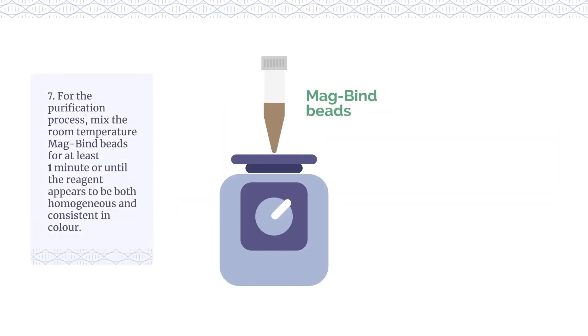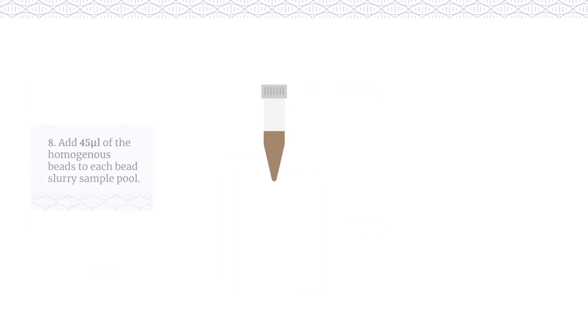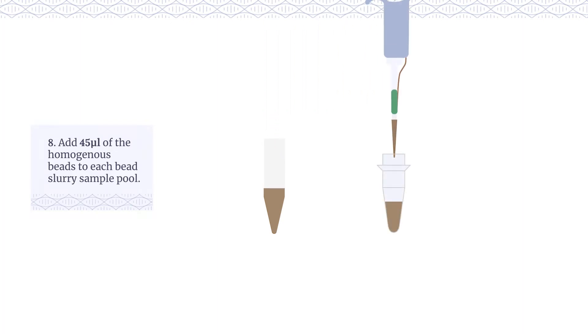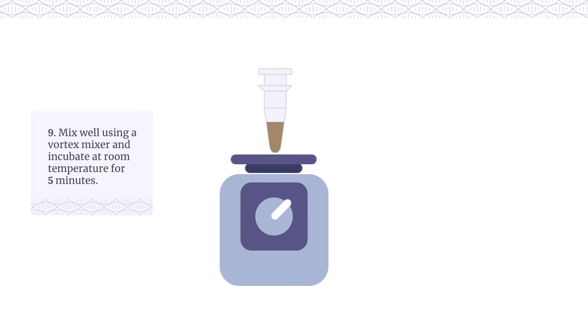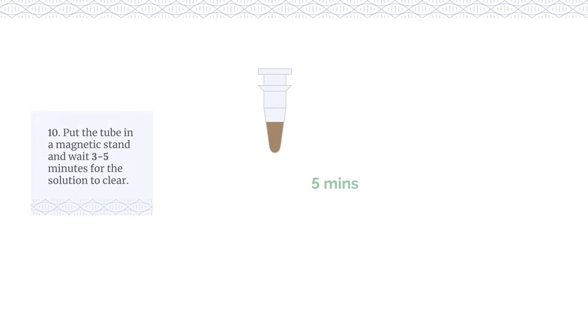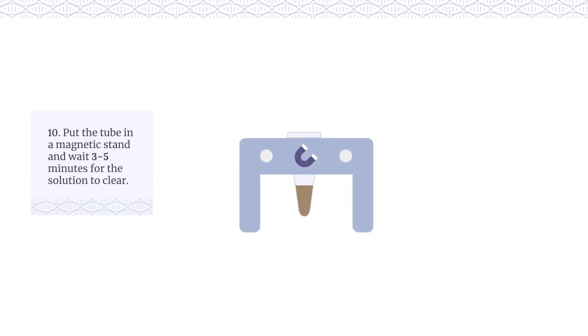For the purification process, mix the room temperature magbind beads for at least 1 minute or until the reagent appears to be both homogeneous and consistent in colour. Add 45μL of the homogeneous beads to each bead slurry sample pool. Mix well using a vortex mixer and incubate at room temperature for 5 minutes. Put the tube in a magnetic stand and wait 3-5 minutes for the solution to clear.